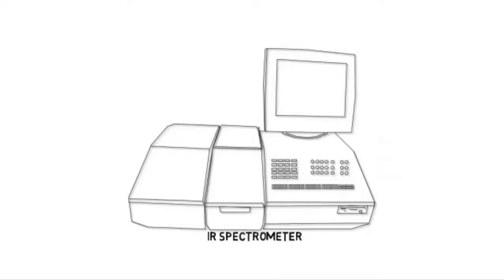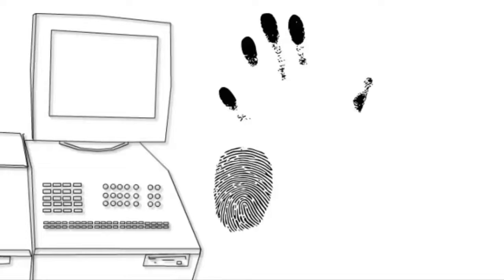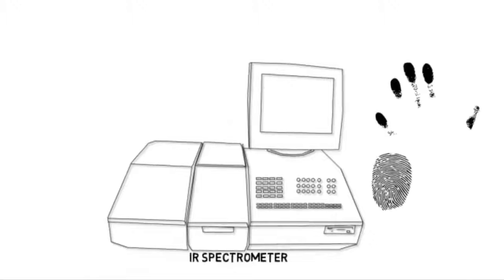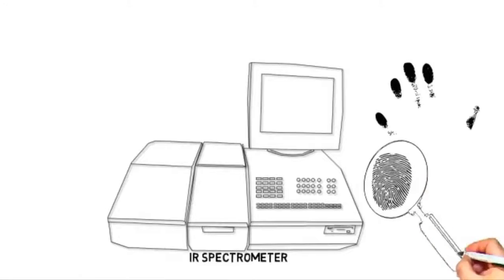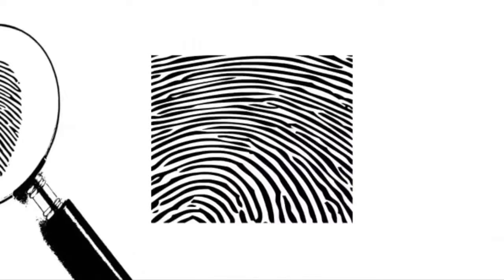So infrared spectroscopy is one important analytical tool or forensic tool used in chemistry. Think of fingerprinting, where each individual has his or her own unique set of fingerprints. And what we do is we look in detail at characteristic patterns within the fingerprint in order to identify the fingerprint or match the fingerprint with the individual. In analysing the fingerprint, so-called arches, loops and whorls will be examined.